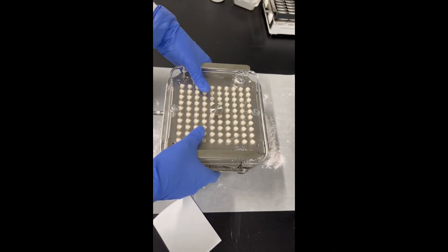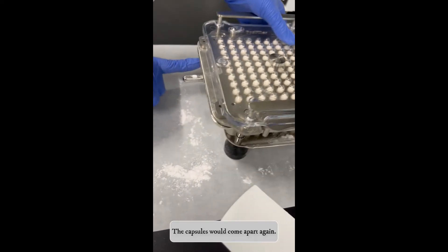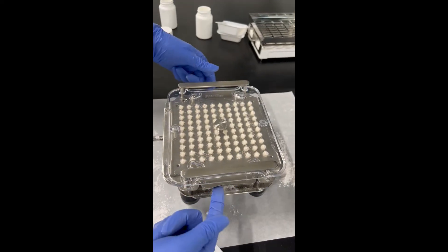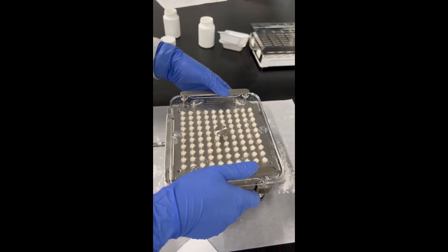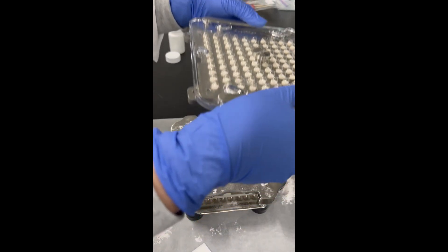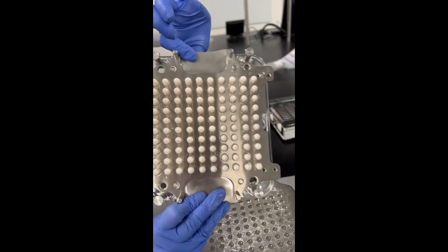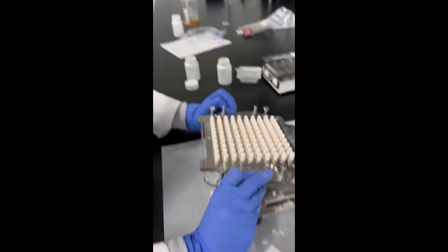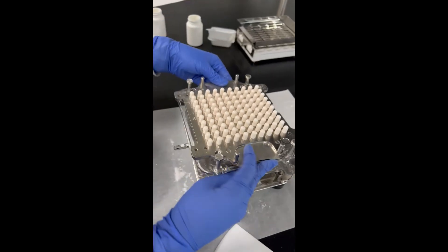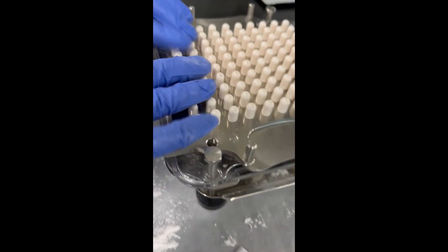Once you do this, go ahead and lift this up — that's also why you push in the lever, because without it, it would be very hard to take the capsules out. So just lift it up like you did earlier, and they should all come out and be right here. Then push them down to make sure they are locked.